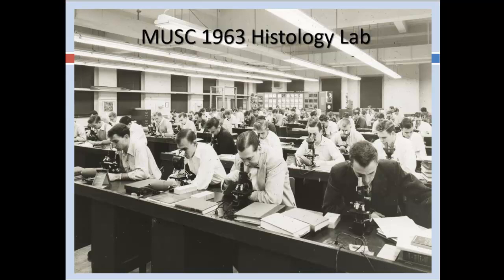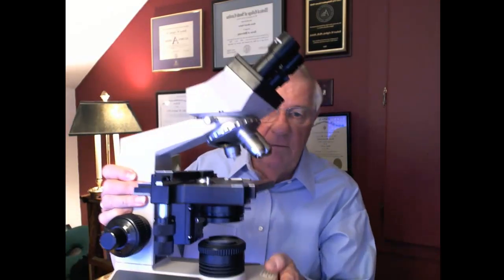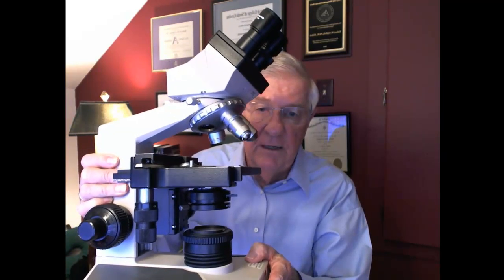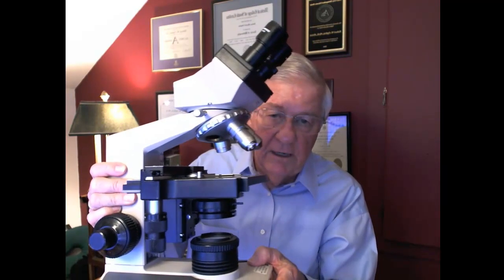When I started, and I'm going to shift over to me, when I started in my career as a student, I was using a microscope like this. And I had to shine a light here or go to a window and get light to shine through so I could see the specimens. And as I then became a faculty member and researcher, I was able to purchase a much better microscope. This is far more expensive. It has a built-in light source and very fine objectives with good resolution and eyepiece and a stage that I could move around easily with controls.